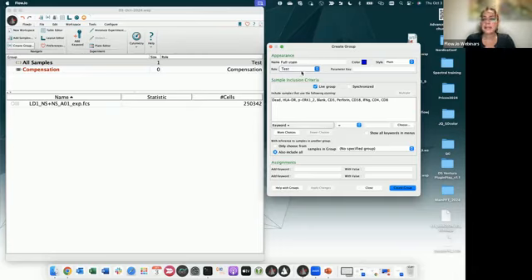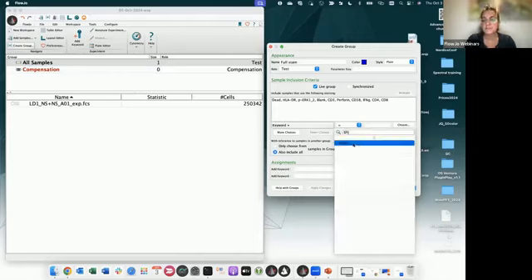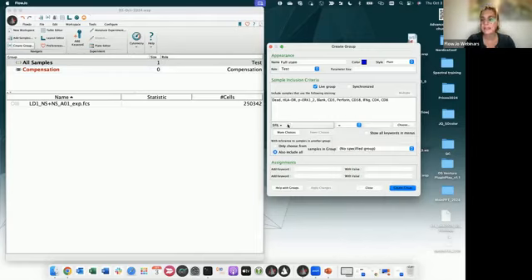So for example, I can tell FlowJo to create a group and make this group live in a way that every time I load a sample into my workspace, each sample that has a keyword associated to it, that can be a file name, okay, just by selecting the file name that contains a word, like in this case, I'm working with live donor, I can use LD for that.